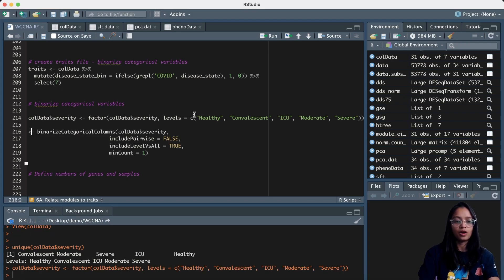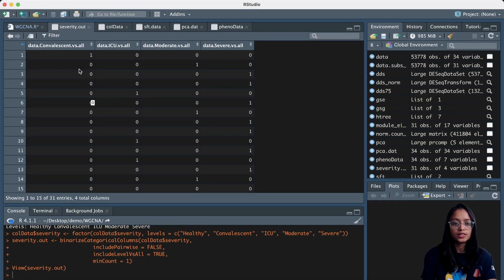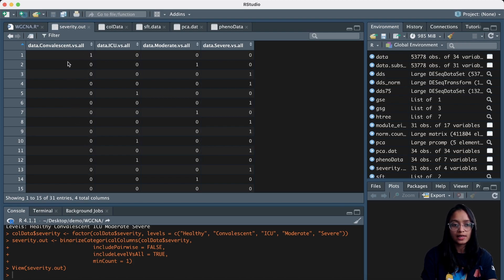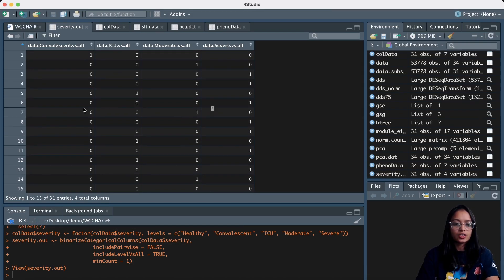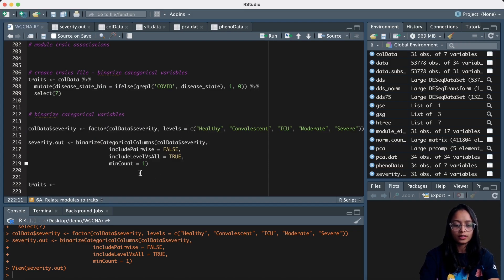I'm going to output this to severity.out and run this. Taking a look at the severity.out data frame, you can see that each level has its own column. The sample that has that value for that level is assigned one, and the rest of the samples are assigned zero. For example, only ICU samples have value one in the ICU column, and so on. Now we want to combine this data with the traits data so we have all trait information in one data frame.